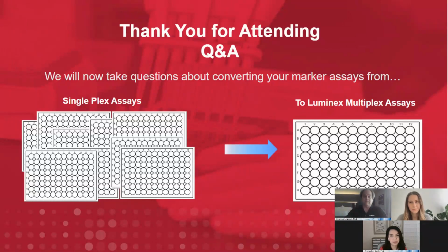you're doing. Yeah, I definitely agree with Steve, and the thing that I would also like to add, as I mentioned earlier, is that the matrix tolerances that I see with the xMAP assay are tremendous.